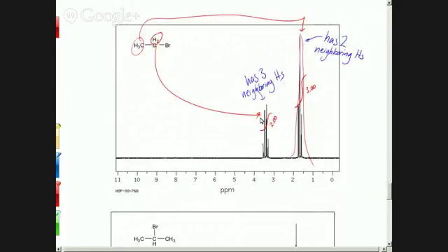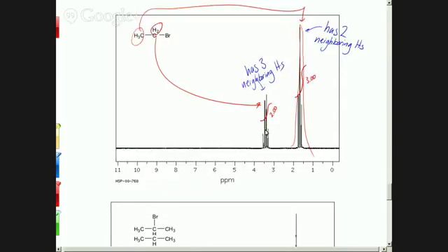This is neighboring hydrogens. How is that 2? Wasn't it supposed to be switched? So this is a group of 2 hydrogens that has 3 next to it. And that gets confusing. That's exactly what is often confusing. The peak itself is caused by those 2 hydrogens, and that's why it integrates to 2. So they kind of tell each other. But the splitting pattern tells you what's next to it. So the integration tells you how many are in that group. The splitting tells you how many are next to that group. Right. So let's look at how that compares to this one.